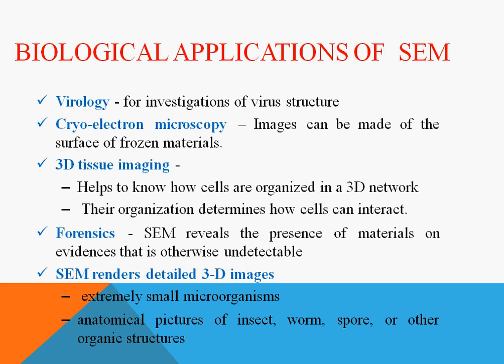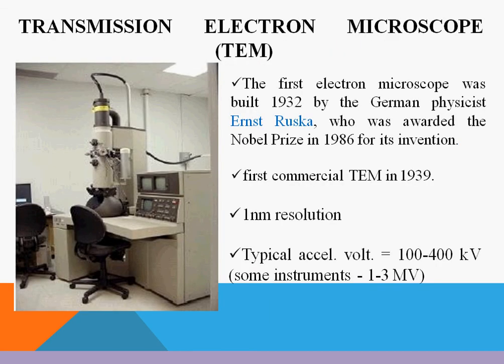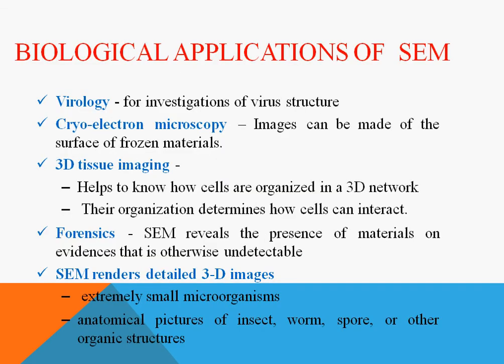These are some of the applications of SEM: virology, cryo-electron microscopy, 3D tissue imaging, forensics, SEM rendering detailed 3D images. So this is what we have regarding scanning electron microscopy.